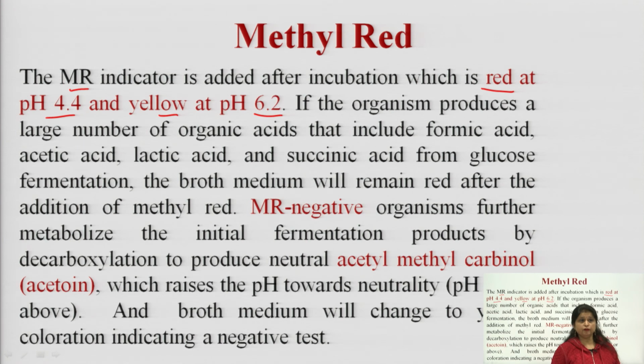If a red color is formed, that indicates an acidic environment has been created within the preparation. So the acidic environment will be identified with the help of a reagent known as methyl red, which shows red color at acidic pH and yellow color at basic pH. So we will be able to differentiate whether our bacteria are fermenting glucose and making the environment acidic.